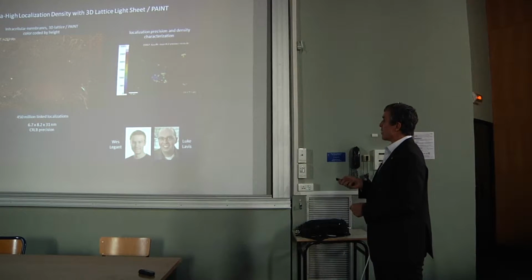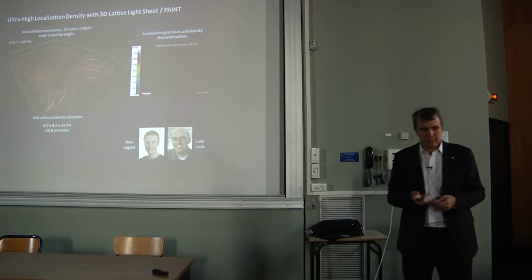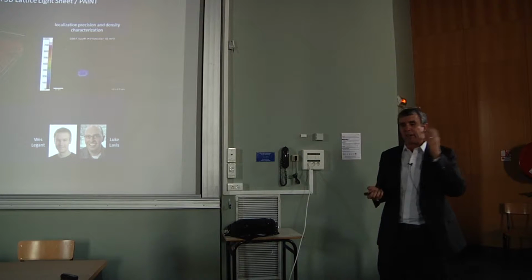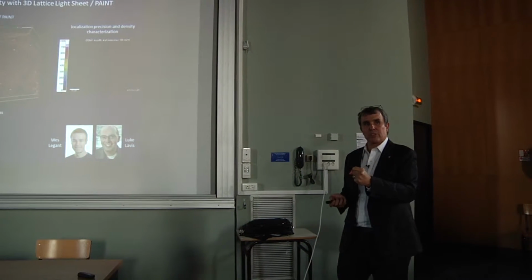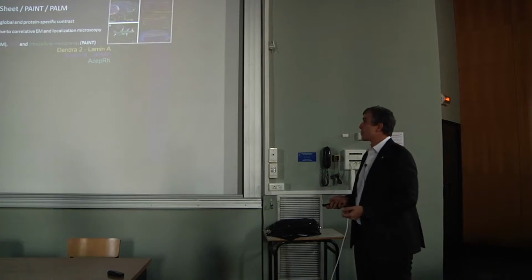This is the same example where we're characterizing the resolution not by line cuts, which I believe is a bad metric, but rather by a combination of the localization precision and the density of localization events that we're able to see.